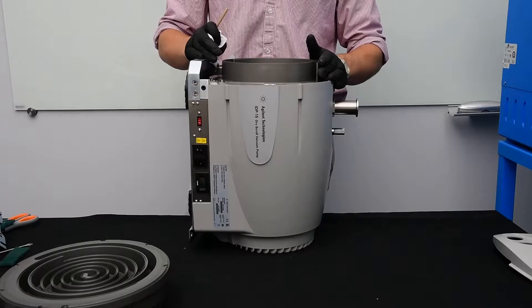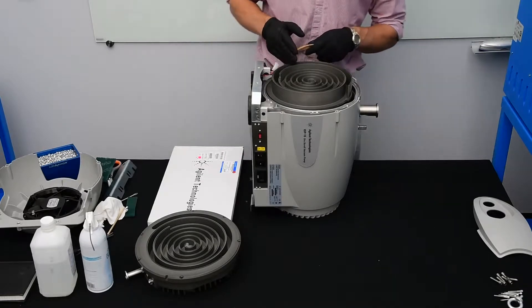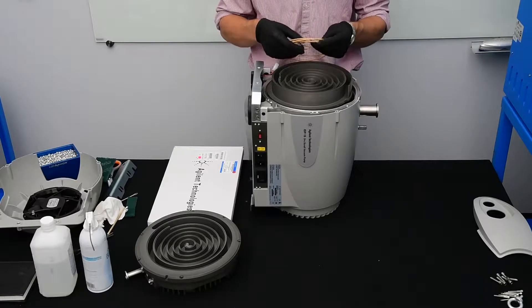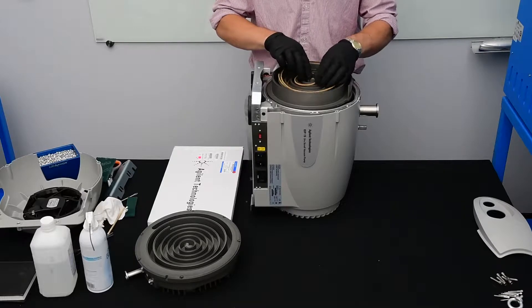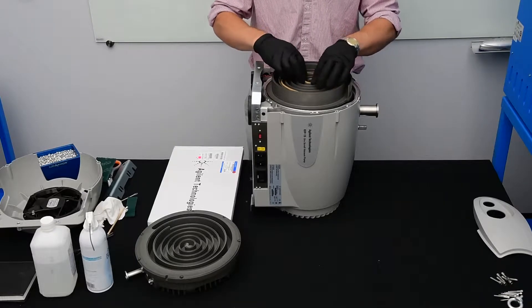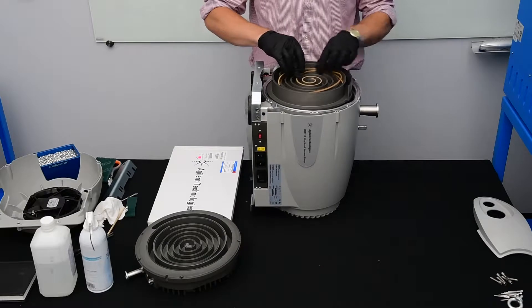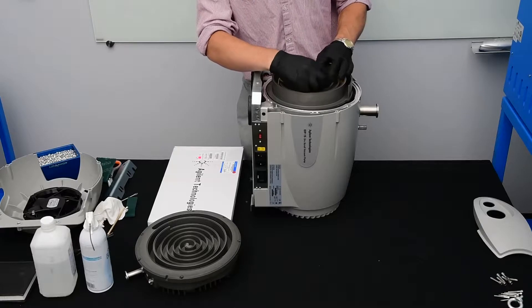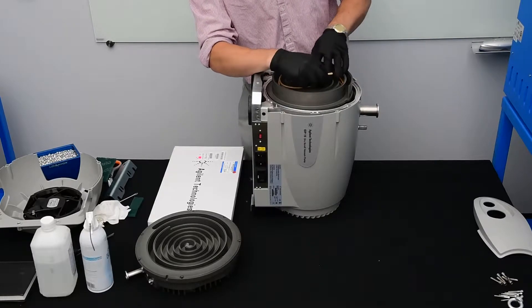Now let's put it back together. We're going to take our new tip seals from our tip seal kit and begin to install them. On the IDP15, there are two sets of grooves in both the orbiting plate and outboard housing. When we start to install the tip seal, we're going to want to give an eighth of an inch to a quarter of an inch to allow for thermal expansion as the pump warms up. As we go around the pump, you will notice small grooves — these teeth act to bite into the tip seal to hold it in place. You might need to use your wooden dowel in order to press the tip seal in and make it sit properly.